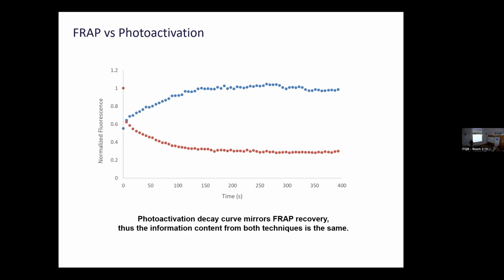Yes? It just occurred to me, you were saying in fact we have a partial photobleaching along the time march. Mm-hmm. But could we assume that a fraction of the fluorophore remains immobile? Yes, it could. And in a FRAP curve, you would get an immobile fraction. The recovery would not be complete if you normalize and if you compensate for the small amount of photobleaching that you have just because you are imaging. If you compensate for that and you still don't have a full recovery, that means that you have an immobile fraction. Part of the molecules are immobile there. You don't have a full recovery, not because you are photobleaching a little bit while you are imaging, but because they did not go away.